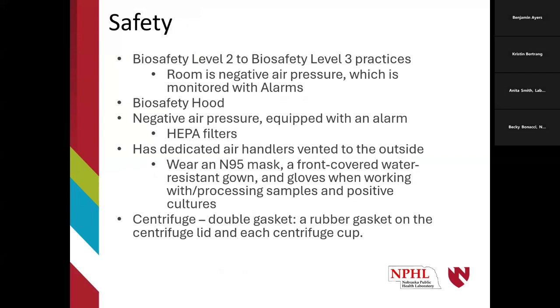So lastly, just a little safety stuff. We utilize biosafety level 2 to biosafety level 3 practices. Our room is negative air pressure. The rooms are monitored with alarms. We use a biosafety hood that has negative air pressure, and again, it's equipped with alarms. It has HEPA filters. It has its own dedicated air handlers, and everything, once it goes through, gets vented out on the roof.